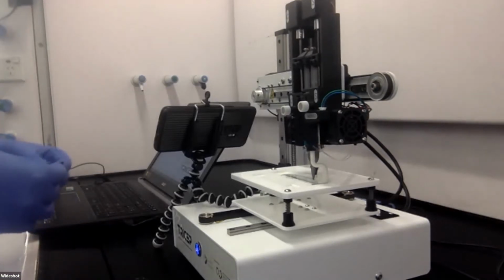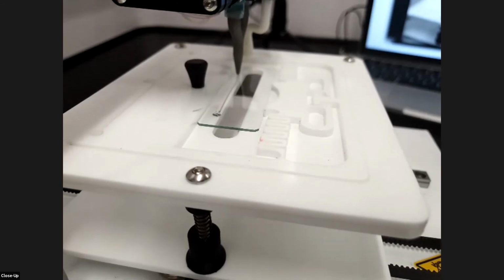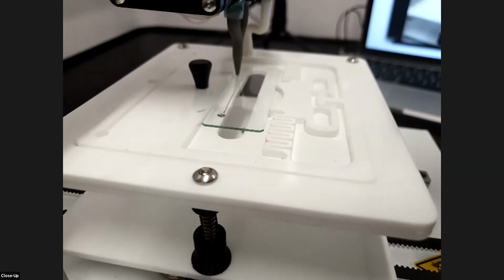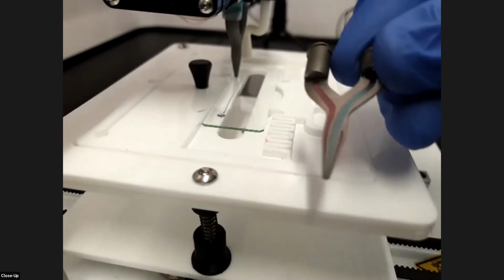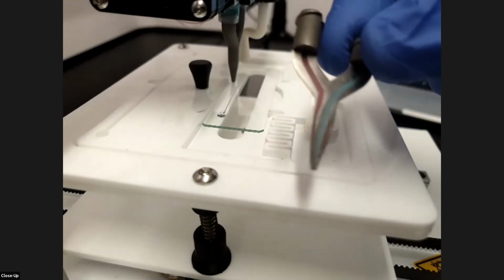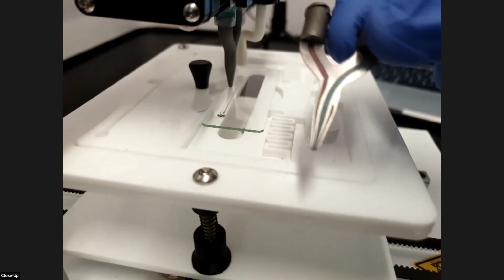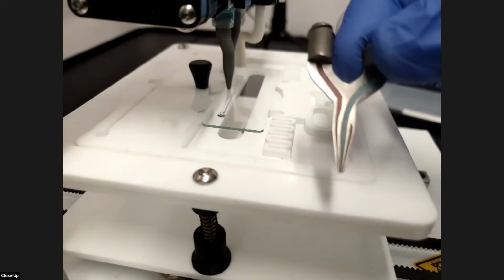The structure of our coaxial nozzle, which camera am I on? That one. Is shown here with our red material representing the shell and the blue material representing the core, with the capability to fully or partially encapsulate the core material during printing.